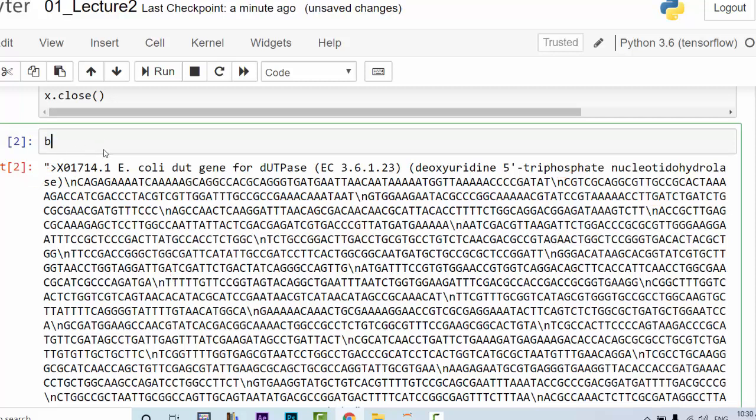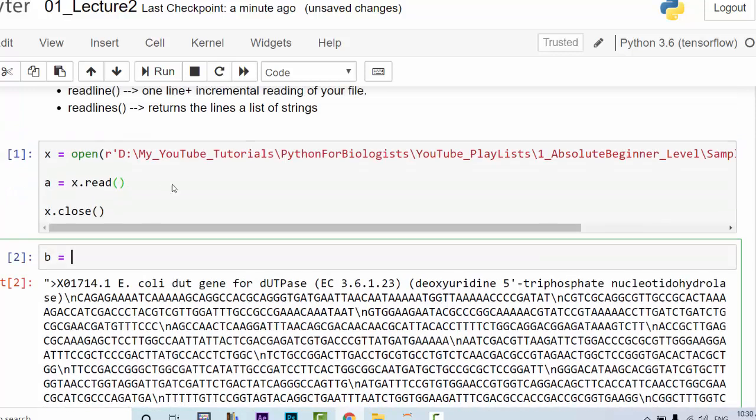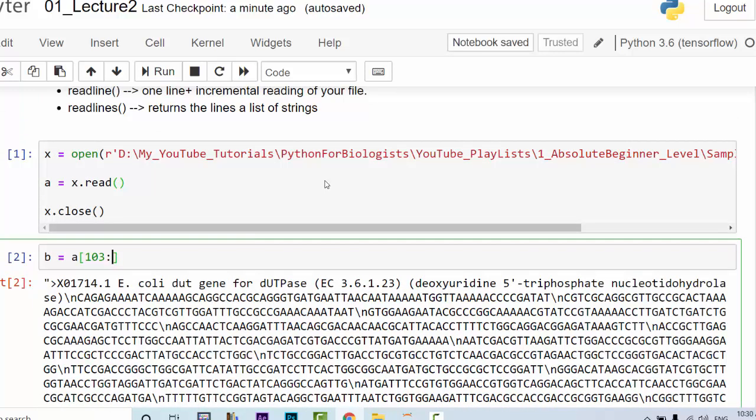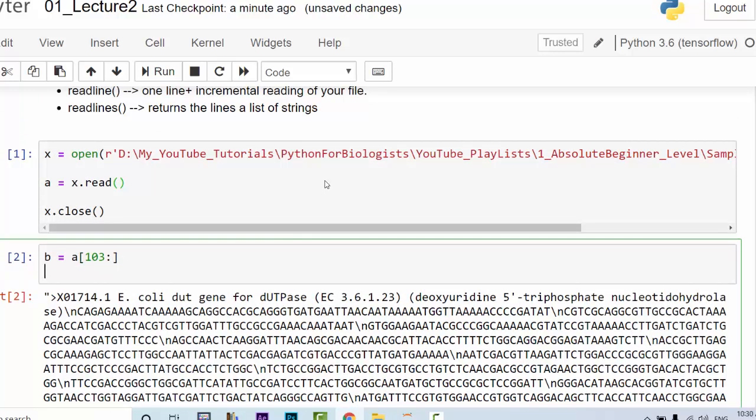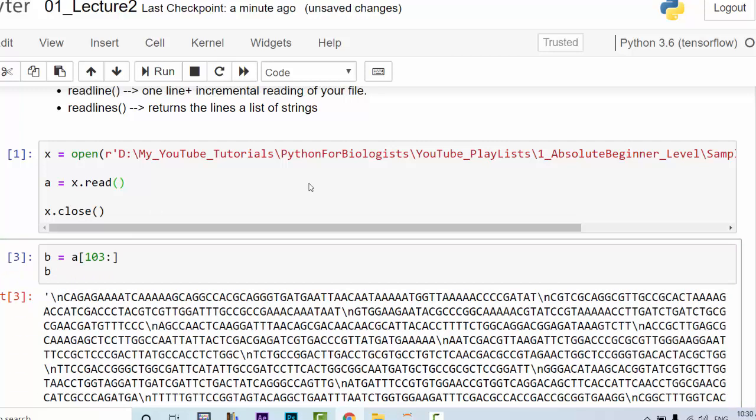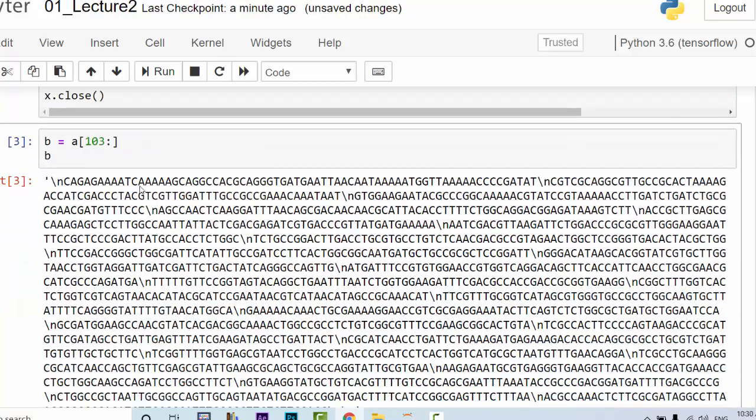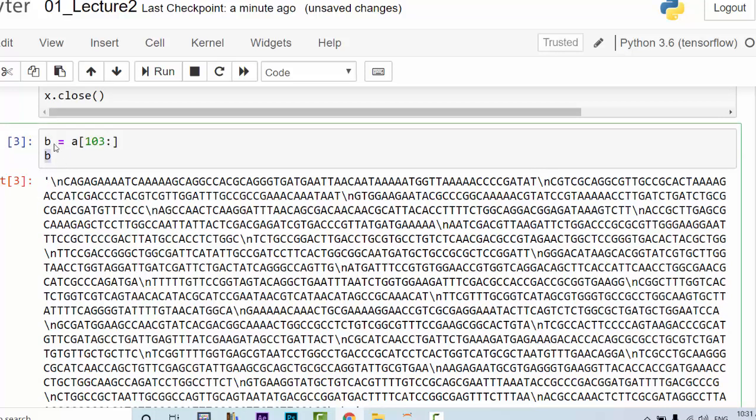So the first thing to do is to remove the first 103 characters. We create a variable and declare a variable. You say b is equal to a and this is from 103 to the very end. Then you can now see what b looks like. So b looks like this which has the first line removed from the FASTA file.